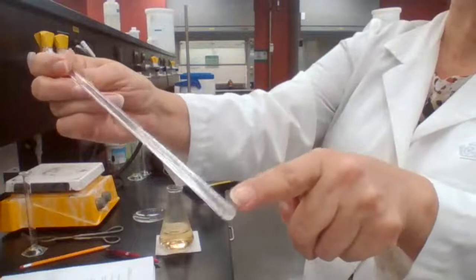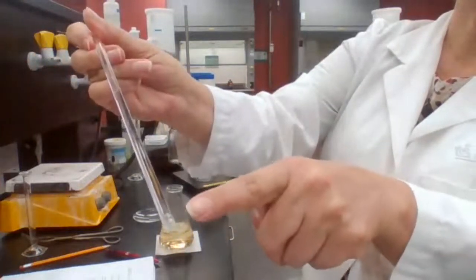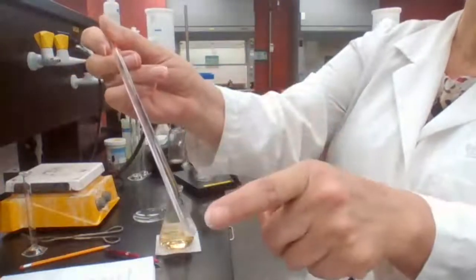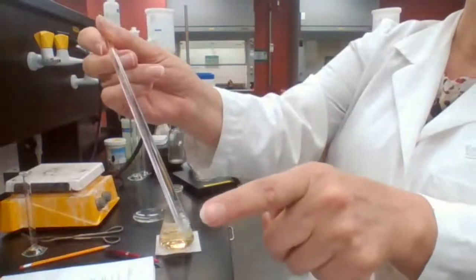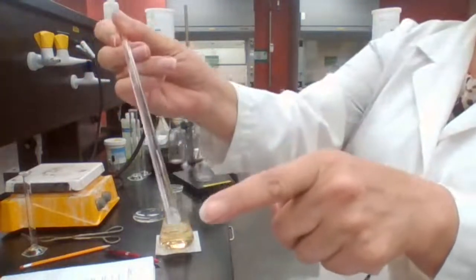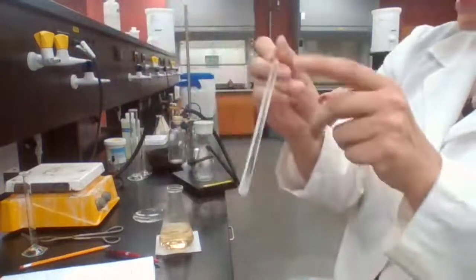You have some white powder right there on the edges at the end of this stirring rod. And when I place this back in, they act as seeds for the crystals. So you could see the seeds or tiny particles.